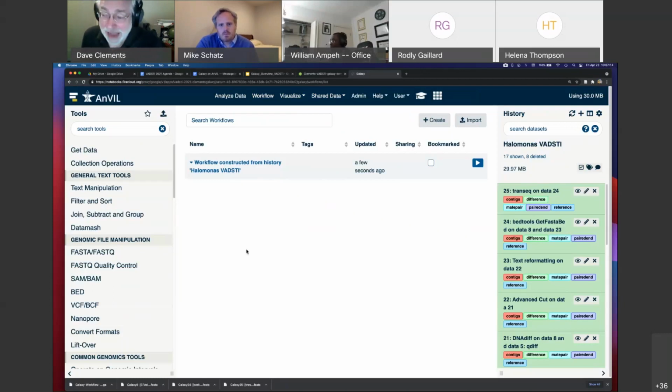But you can edit it while it's been downloaded as a text file. And there are programs, so people write programs that do that, or they just edit the workflows. But in general, people use the editor, and that editor is available on all Galaxy instances. Okay. Cool. Thank you, William. And did I answer your Kmer question?